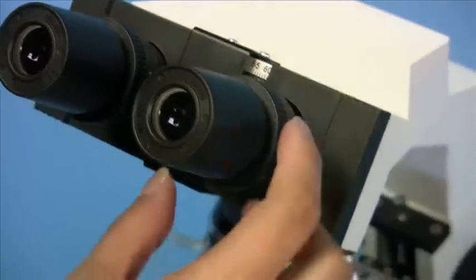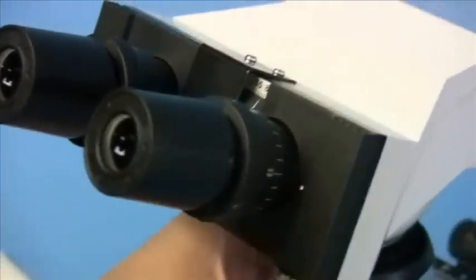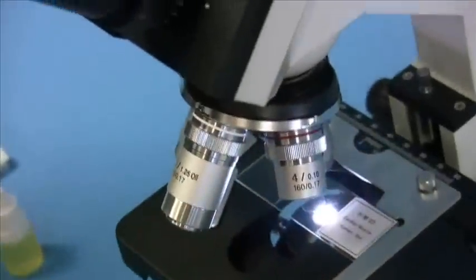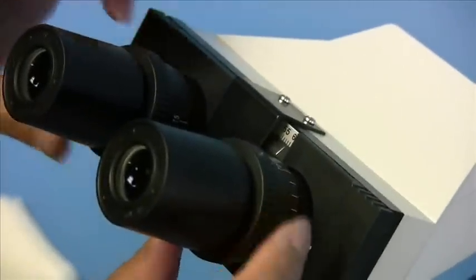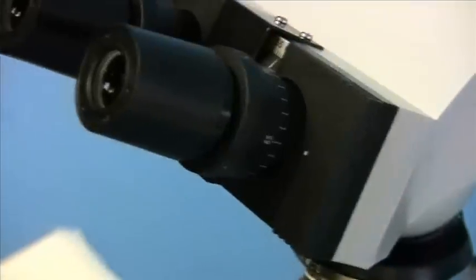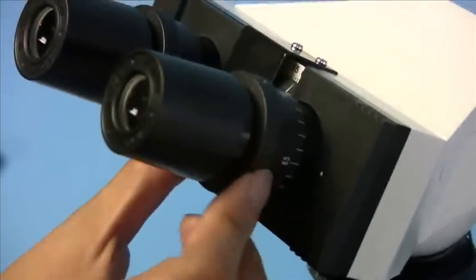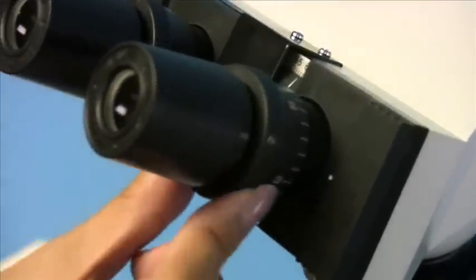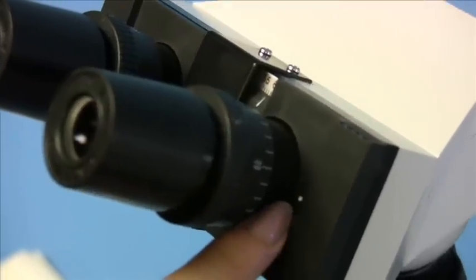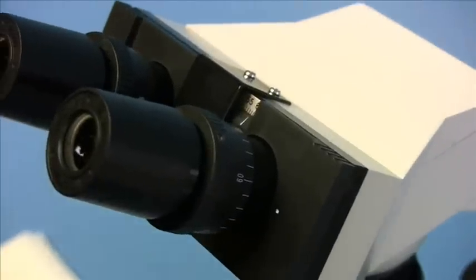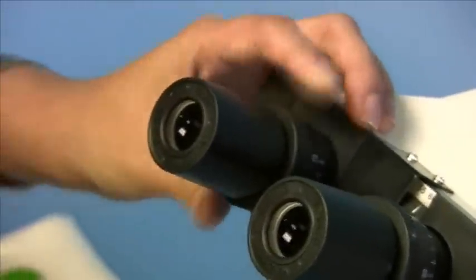Now you also want to adjust the ocular diopter. So first, place the 10x objective into position and note the interpupillary distance. Rotate the diopter ring to both diopter rings to that number. So in my case, I have 59 as my interpupillary distance, so I simply turn the diopter ring to that number so that the white dot points to 59. And I do the same on the left side.